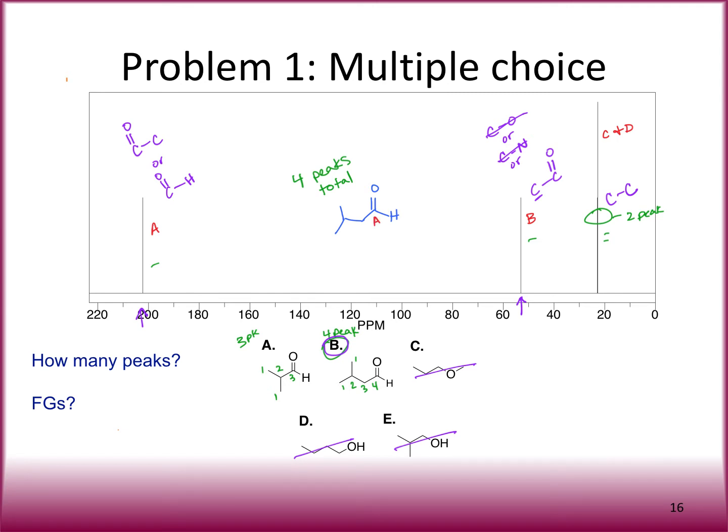So next is B. So B, it says it's actually the carbon next to the double bond, so I'm going to put that here. And then for C and D, they're so close together, it really doesn't matter. So you can put them either like this, C and D, or you can have them switched where it's D next to the B and then C. Either one of those is fine with me. I wouldn't count off for either. Okay? So that's our answer. And then all those peaks matched. We don't have any extra peaks. We don't have anything we missed.